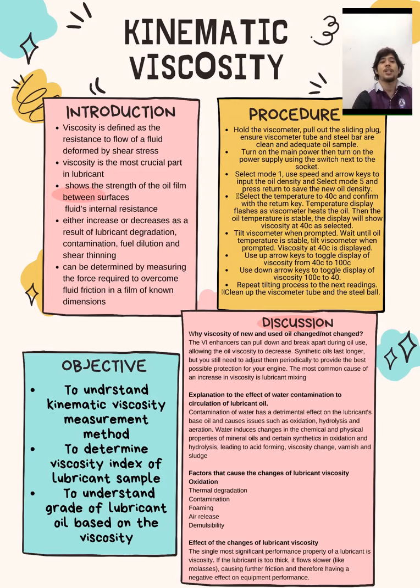Remember to clean up the viscometer tube and the steel ball. After you finish, put back the steel ball inside the viscometer tube. After finishing everything, do as usual: clean up the workstation using a solvent such as acetone. That's the procedure and the methodology.